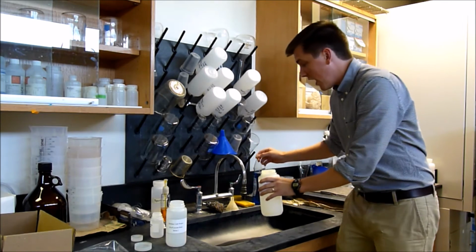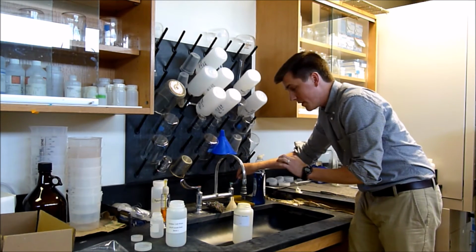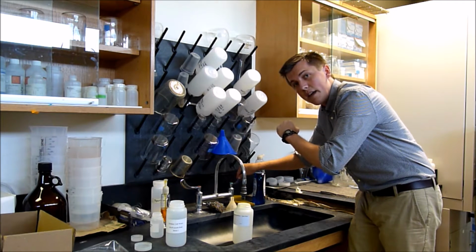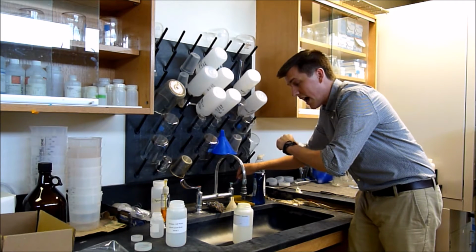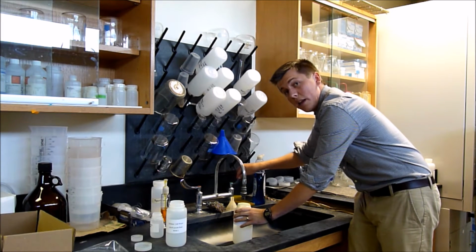And so when you do that, you want to make sure you place the bottle under there before you open the tap. And before you open the tap, make sure that you take note of the time so that you can time 45 seconds between the first sample and the second sample. So let's go ahead and begin.